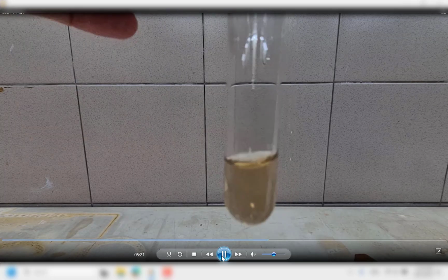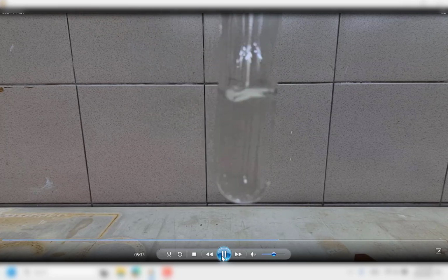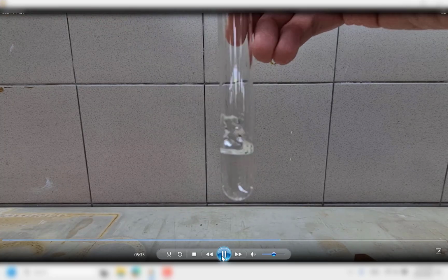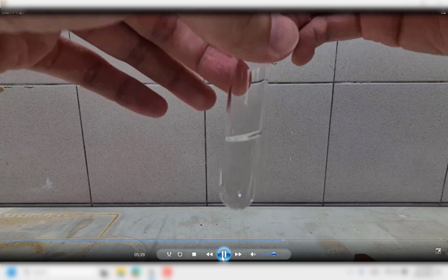Okay, so I'm going to add in, let me see what we are going to do. Okay, so we're going to add something in. This is adding H2O2. You'll notice that it decolorizes, so you have to record that. Some of you might be wondering, why does it decolorize? That's something you can think about as well. If you try adding water to the sample, you can see whether it will decolorize.